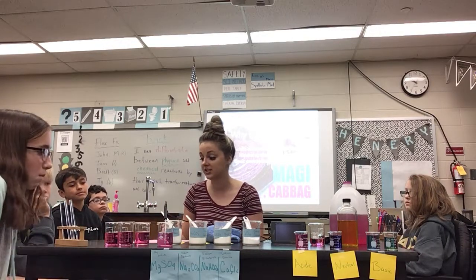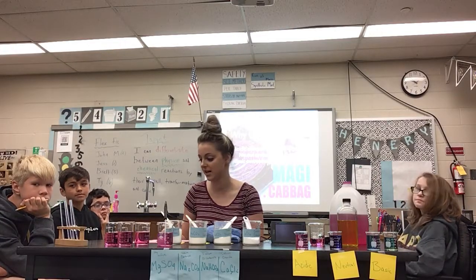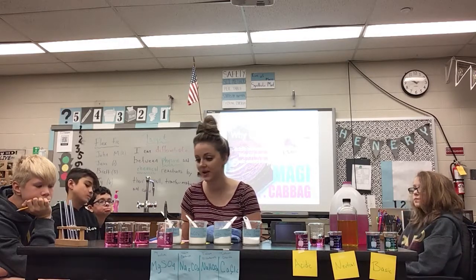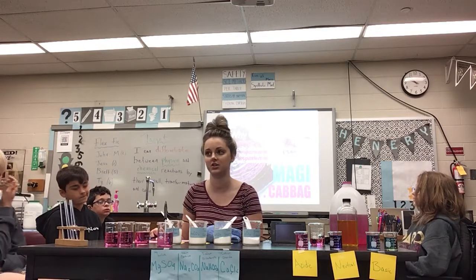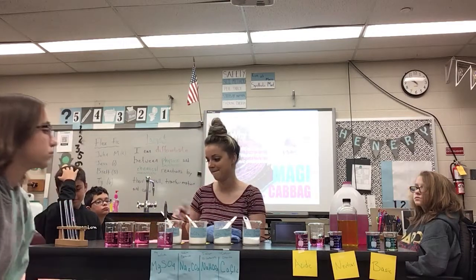Okay, so in other words, acidic, basic, or neutral? Acidic. Was there gas produced? Major smell? No. Okay, what about, do we have a solid, a precipitate? No. So in other words, is there any evidence of chemical change? No. Okay, are we landing at a temperature yet? It's not on.